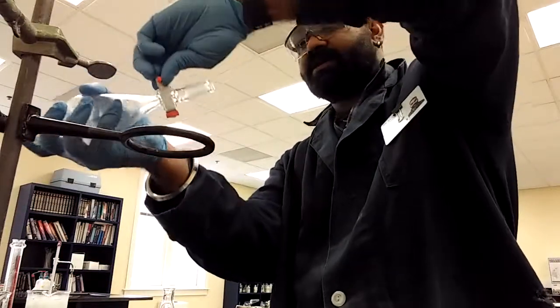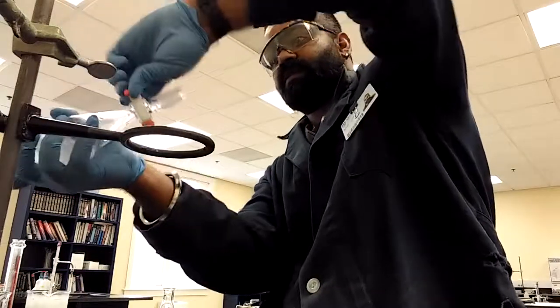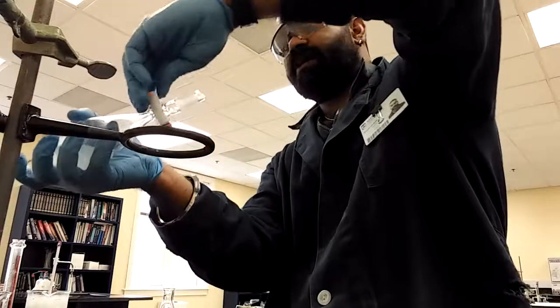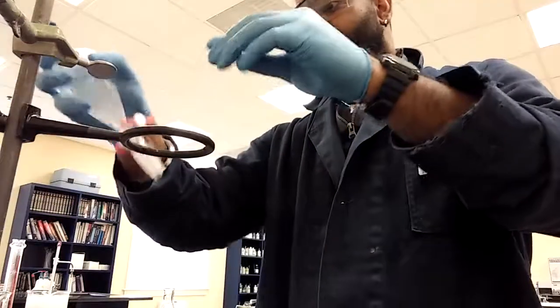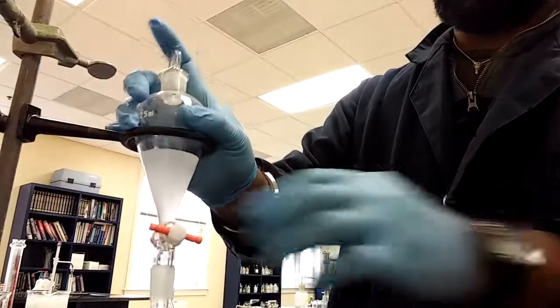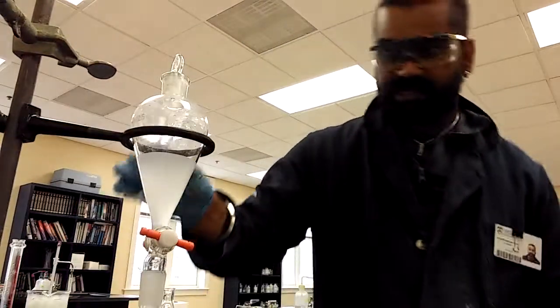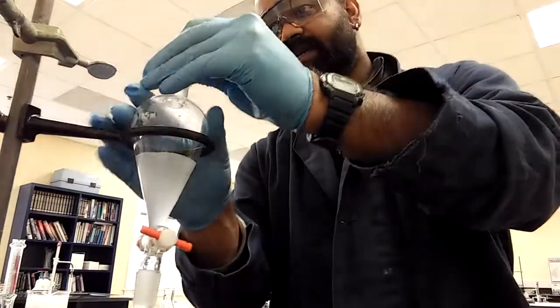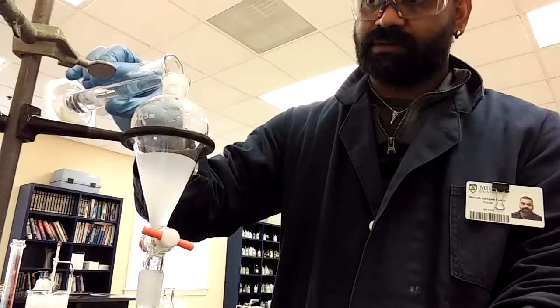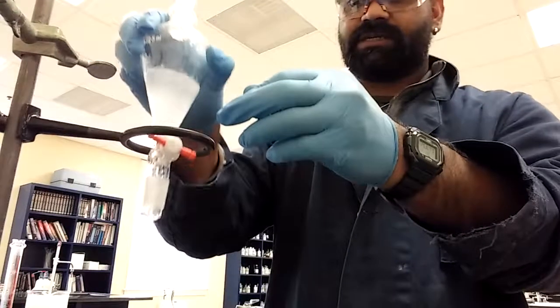Please, do you hear that? Face it away from you or your lab partner. You don't want it in their face. Okay, that's good. I'll probably go a little more vigorous when I'm all set and done, but that is good enough. You're shaking it. Add a little bit more. Shake it.